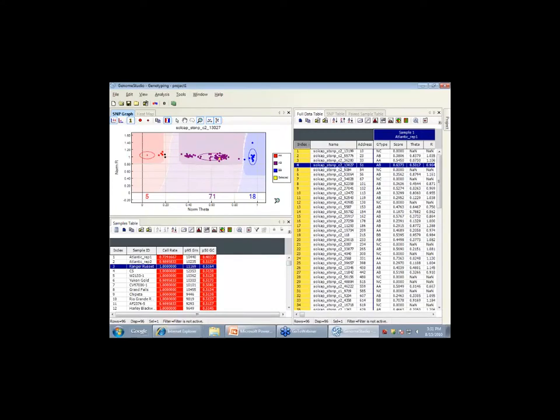So we've played around with the clusters. We've selected low-signal SNPs. We've sorted samples. We've exported clusters. What we're going to do now is add new data. So this is 96 samples with 96 SNPs. I've run a new plate. Let's combine two data sets, these 96 samples with 96 new samples.